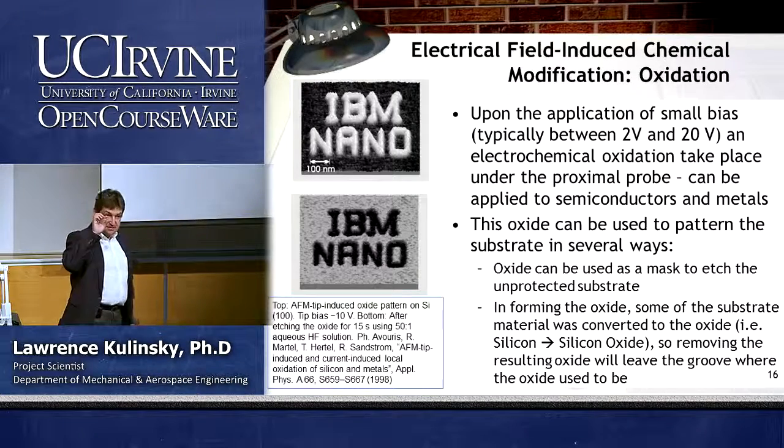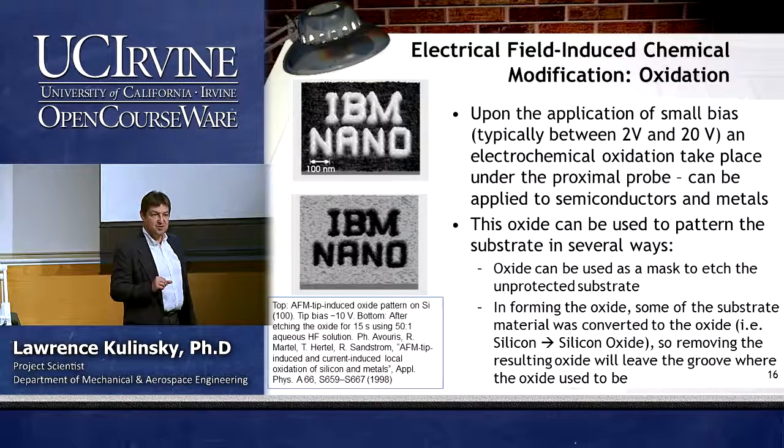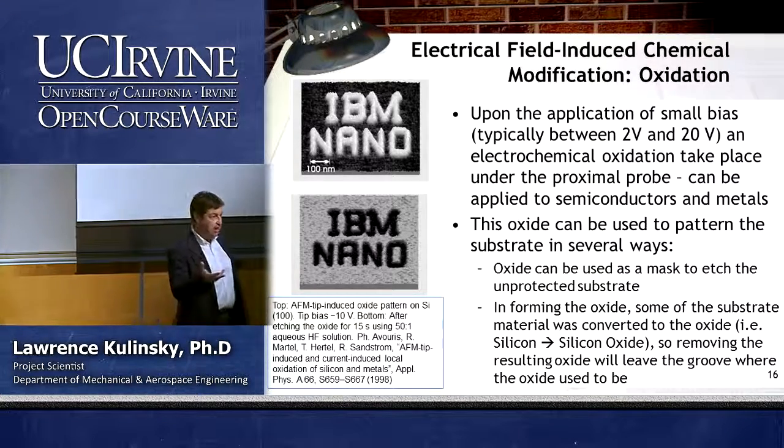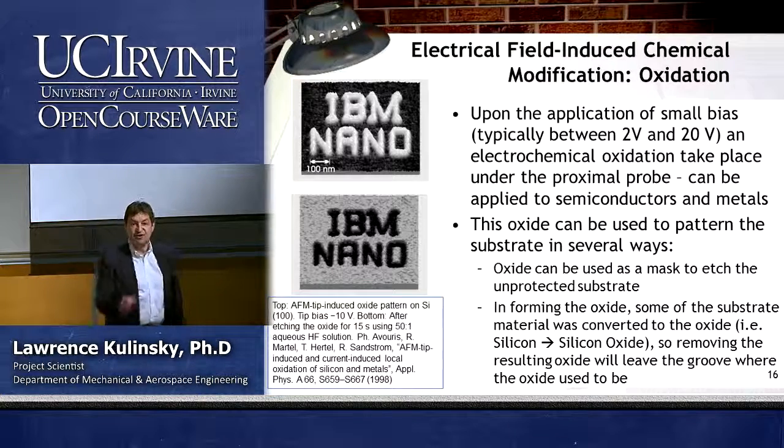Now the depths, we can control depths to a fraction of a nanometer. We can control depths very, very well, because oxidation is a process that we control very well. Do you have a question?